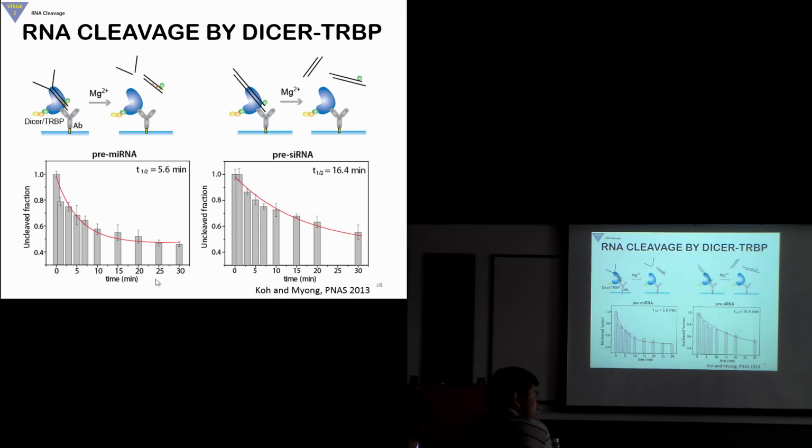We also tried to look into our traces to see if there are any differences, but we couldn't spot any. The periodicity didn't change much, so we went to a lower temperature to slow it down and see differences better. We think there could be some differences that we're not sensing. We're also examining a whole bunch of TRBP-like proteins to cross-compare which ones slide better and which ones less. Great question.